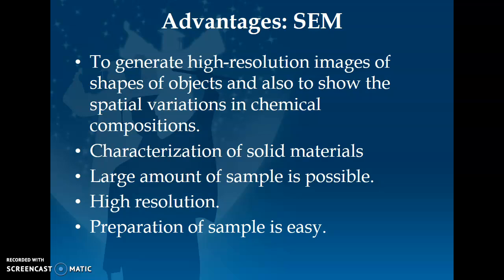Large samples are possible in the case of the SEM; comparatively larger sizes are possible. Then we have high resolution. Also, preparation of the sample is very easy in a scanning electron microscope.